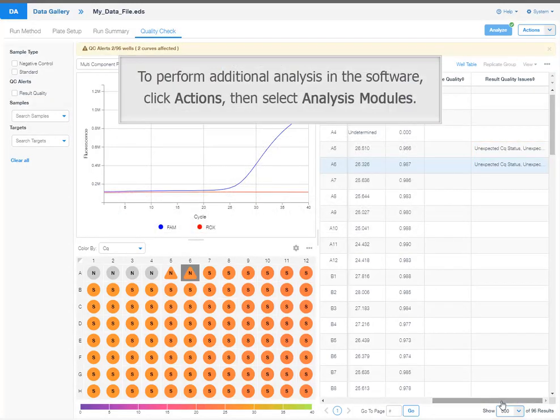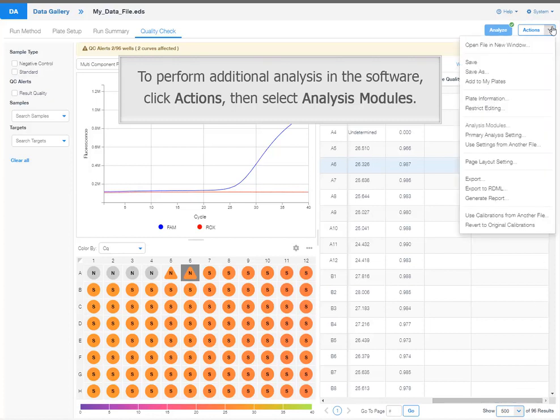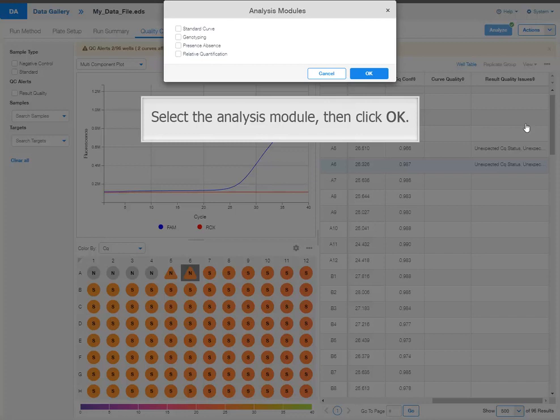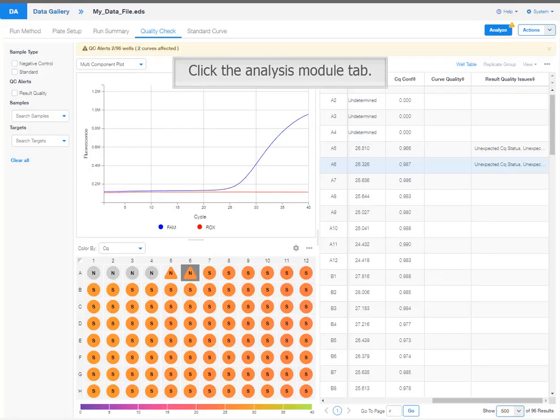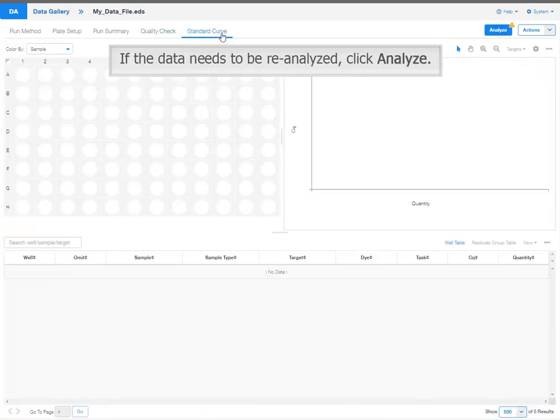To perform additional analysis in the software, click actions, then select analysis modules. Select the analysis module, then click OK. Click the analysis module tab. If the data needs to be re-analyzed, click Analyze.